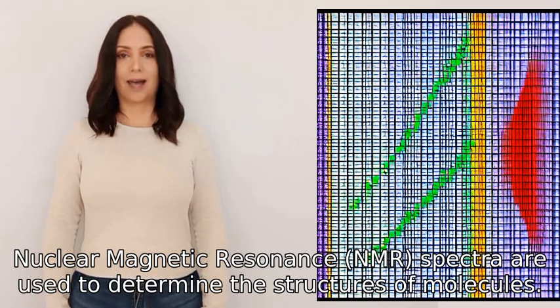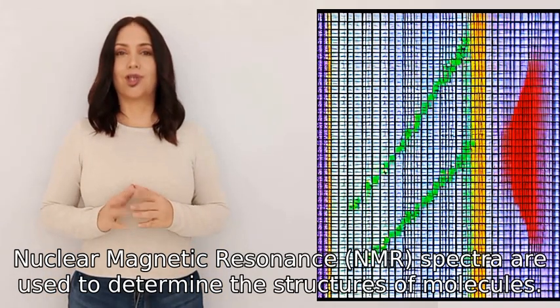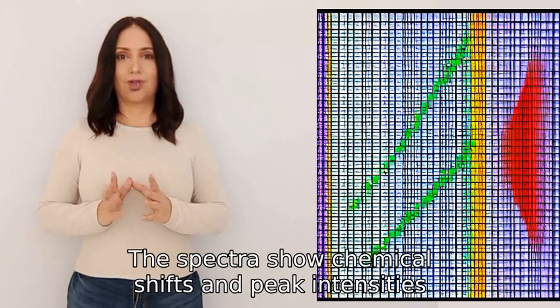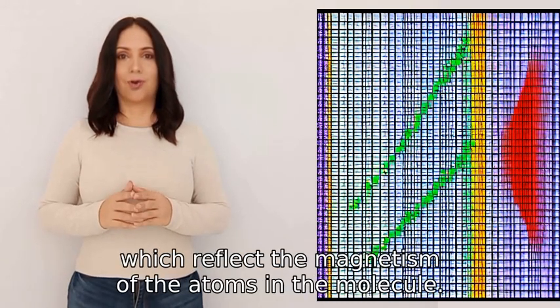Nuclear magnetic resonance (NMR) spectra are used to determine the structures of molecules. The spectra show chemical shifts and peak intensities, which reflect the magnetism of the atoms in the molecule.